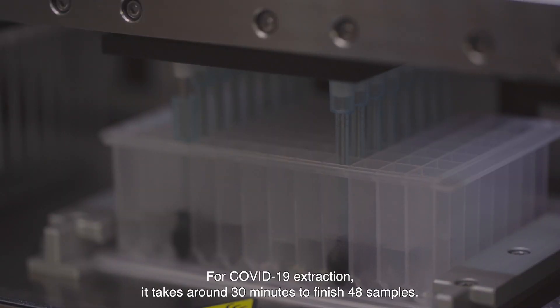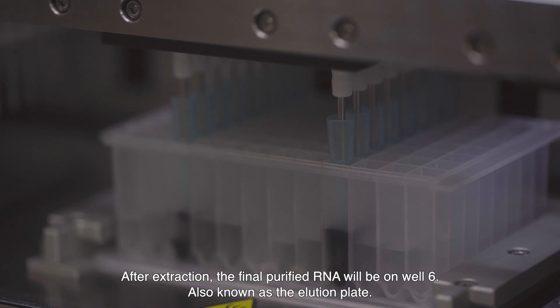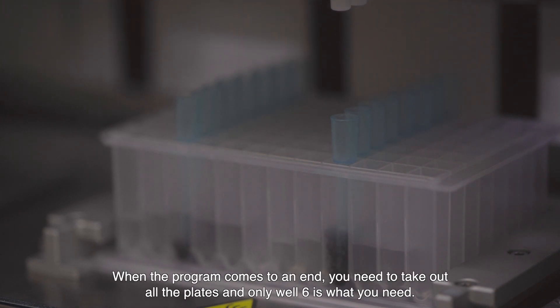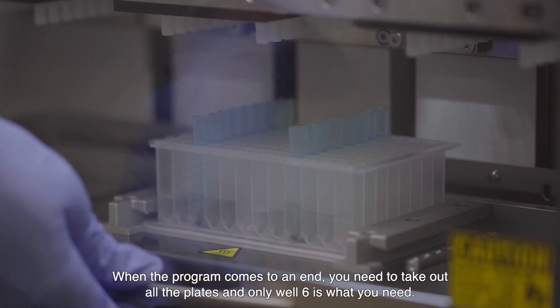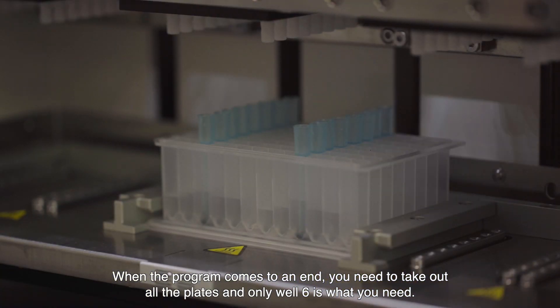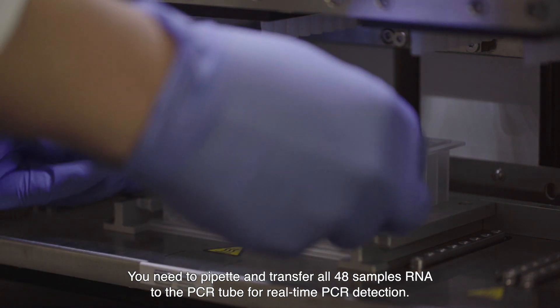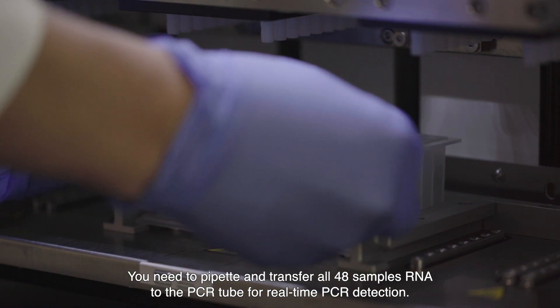For COVID-19 extraction, it takes around 30 minutes to finish 48 samples. After extraction, the final purified RNA will be on well 6, also known as the elution plate. When the program comes to an end, you need to take out all of the plates and only well 6 is what you need. You need to pipette and transfer all 48 samples RNA to the PCR tube for real-time PCR detection.